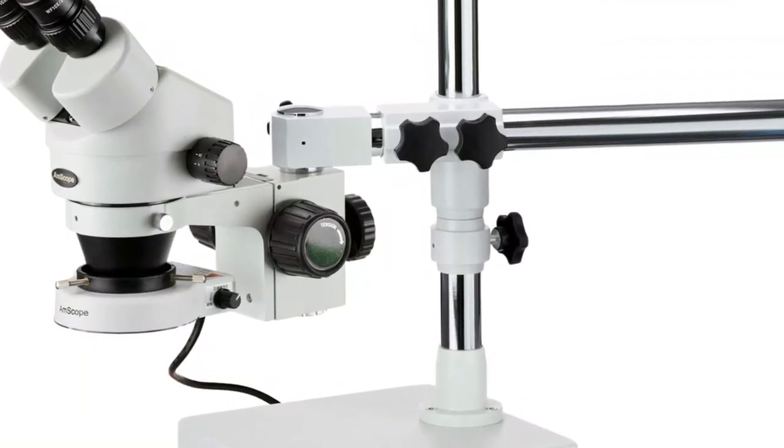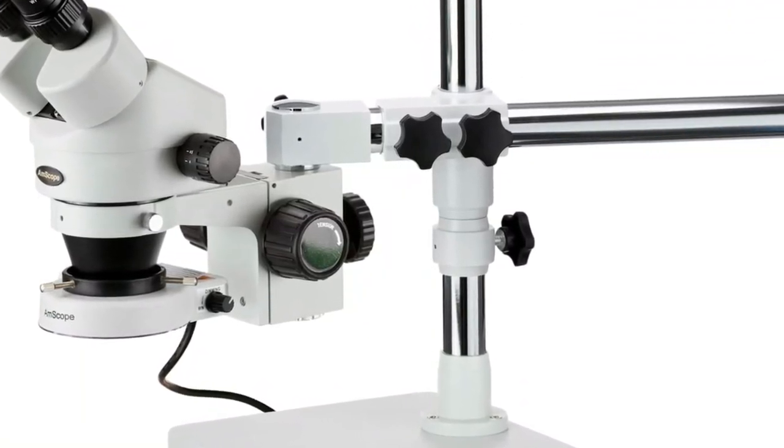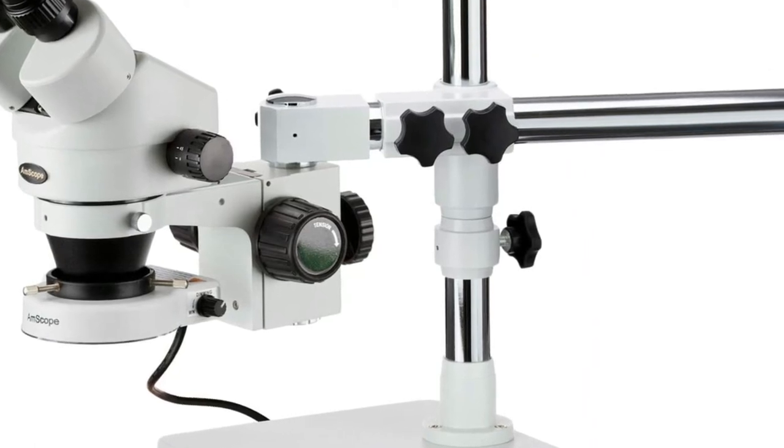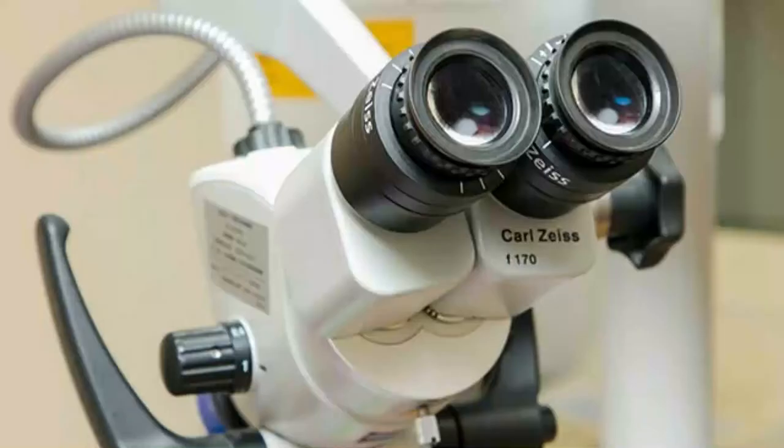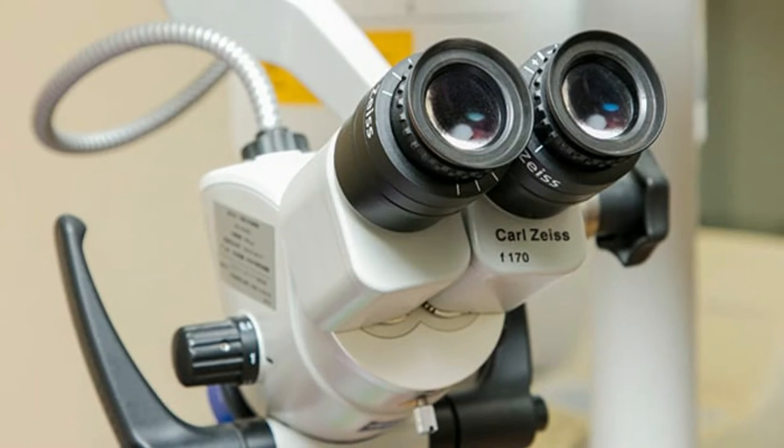Which makes it ideal for manipulating the specimen under observation. The versatile illumination provides both incident lighting, top, as well as transmitted, bottom, illumination.